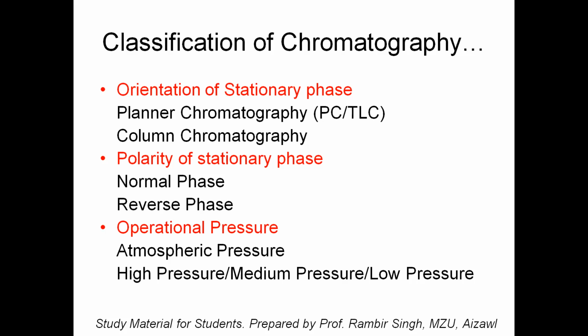But incidentally, it is insoluble even in the most polar solvent, water. So note it down: it is one of the most widely used stationary phases today, which cannot be dissolved by non-polar as well as polar solvents.